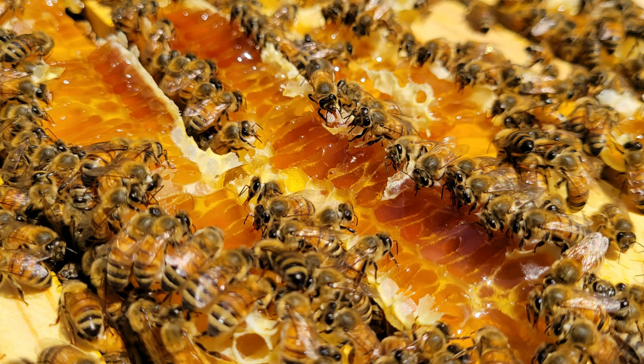So it's up to us, the beekeepers, to make sure we do our best job of making sure this honey is going to last for our customers and for ourselves. The bees put a ton of work into it, so for us to screw it up would be a big no-no. So here's a little clip I shot last week after I extracted my honey of me using my refractometer, and you'll see how it's used, and it's very, very simple.